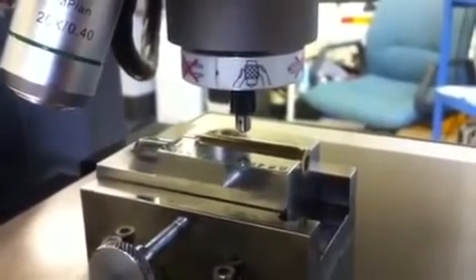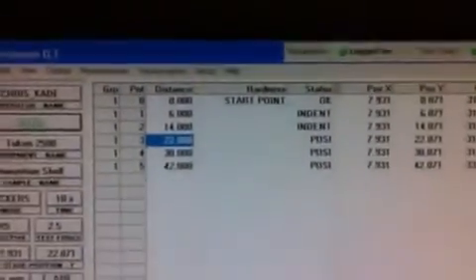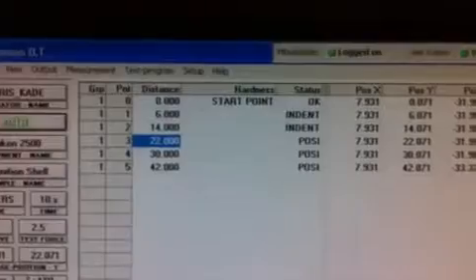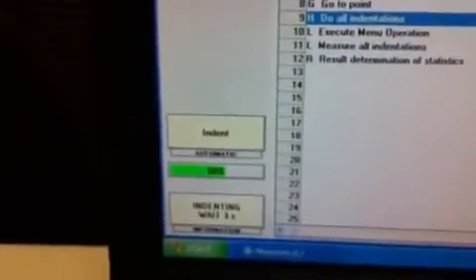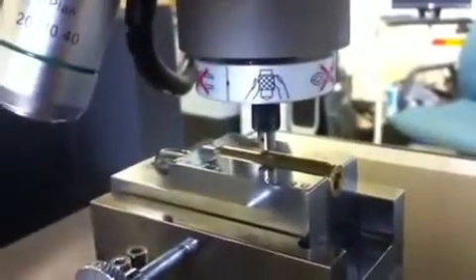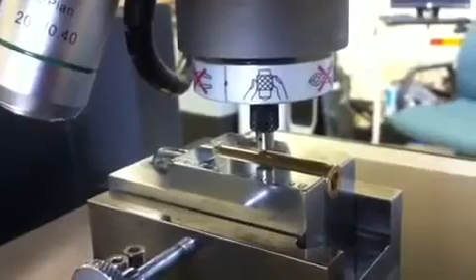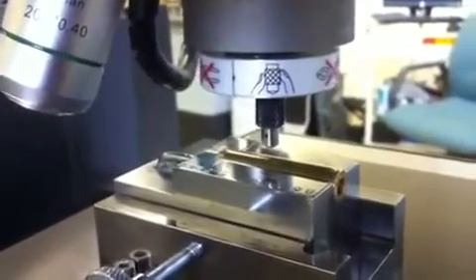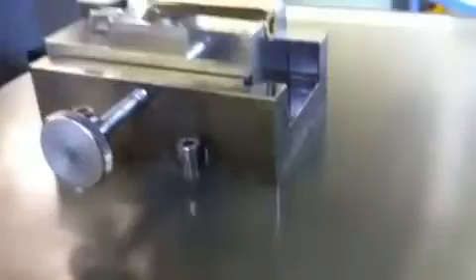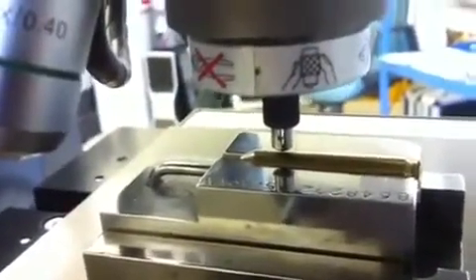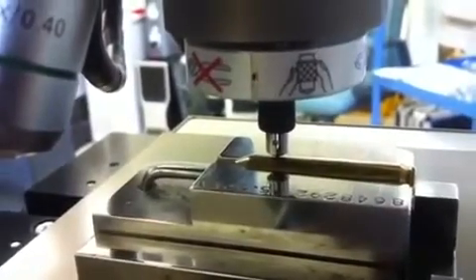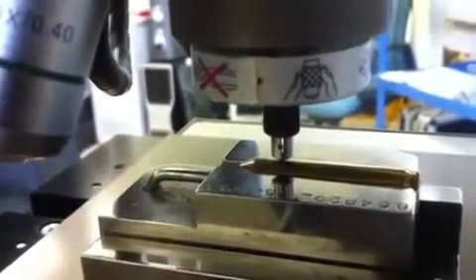The indentations are being made. We're on our third indent — you can see here on the software it says we're on our third indent, we've made two and we're indenting our third, showing you the status of the indentation. The indentation will then retract and the stage automatically navigates to the next location. We're now making our fourth indentation on the OD.